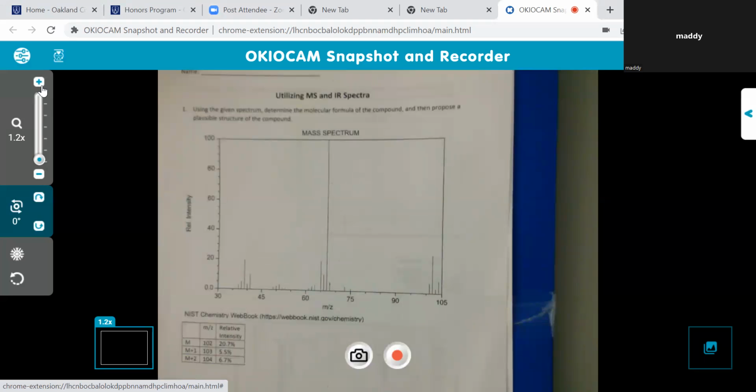So I wanted you to get a feel for what that is like, seeing the spectrum yourself and maybe even creating a data table. I went ahead and created the data table for you in this example though. So we're going to determine the molecular formula of the compound using the same 6-step process, okay?